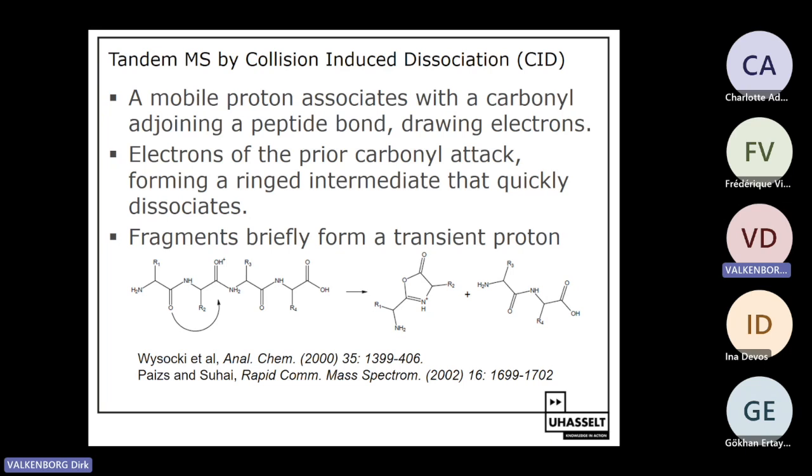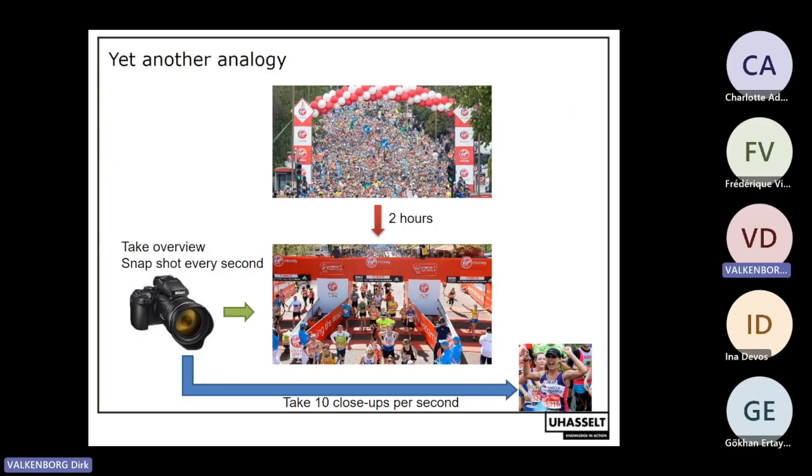But since we have many copies of that single selected peptide, we hope that we will for sure break all the possible peptide bonds and have a good measurement of those masses. Okay, if you want to read more about this, you can refer to these two manuscripts, or you can just believe me that at the end of the day, if the ion statistics work out well and we have a little bit of luck, all the possible peptide bonds have been broken a few times so that we can see a good signal in our mass spectrometer. Okay.